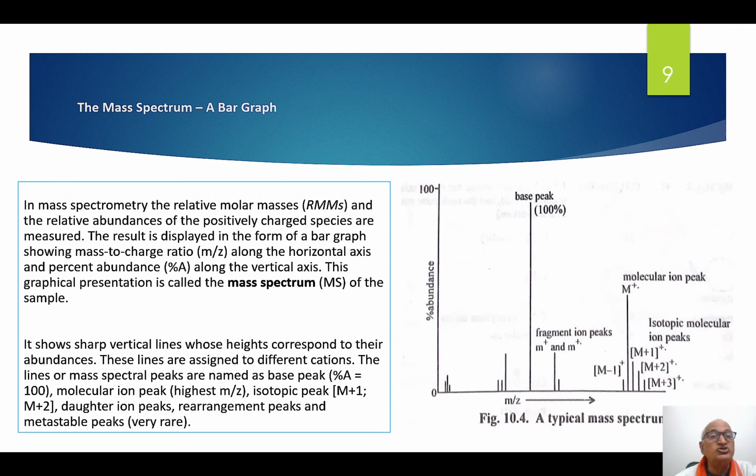Now, what is the mass spectrum? The spectrum is shown here. I have taken this diagram from my own book on spectroscopy, chapter number 10. See, the bar graph is called the mass spectrum.